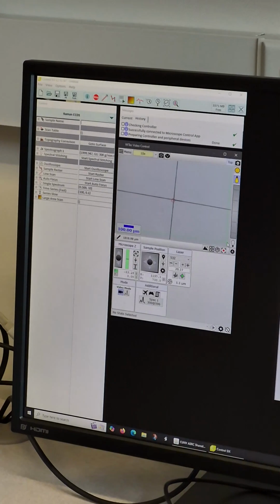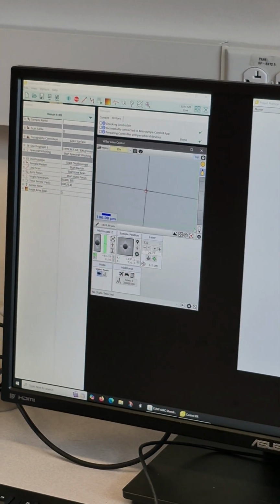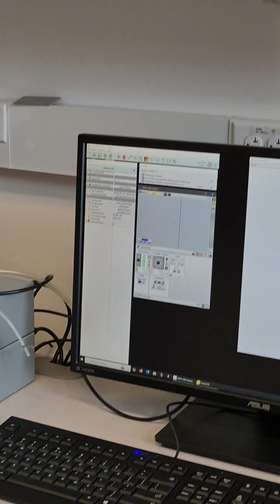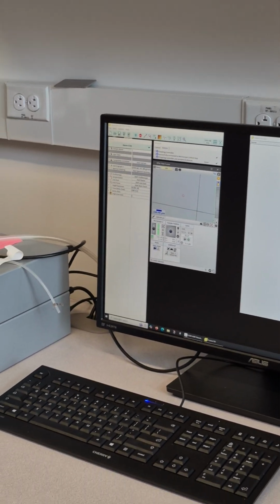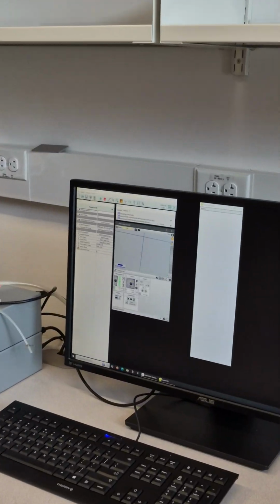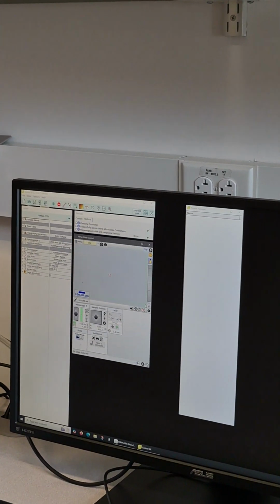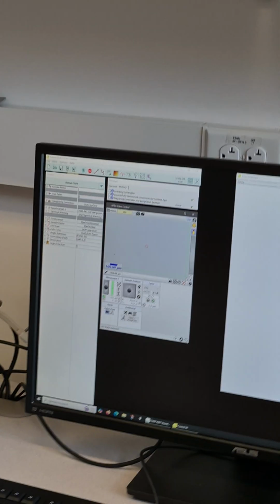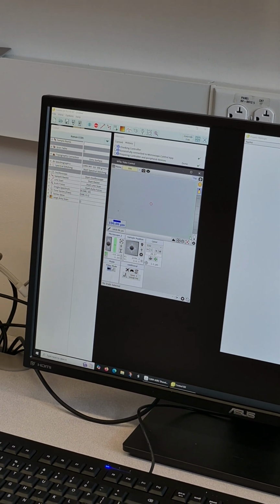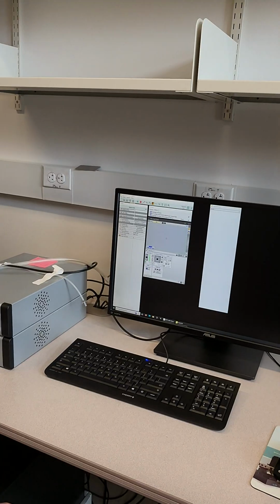Now comes the question. Because this is a standard calibration sample, we put an etched cross in the middle. But for a silicon sample surface, many times we have dirt. A lot of times you will see a sample surface like this, with no features. So how do you focus on the sample surface? That's a question, and a difficult one.